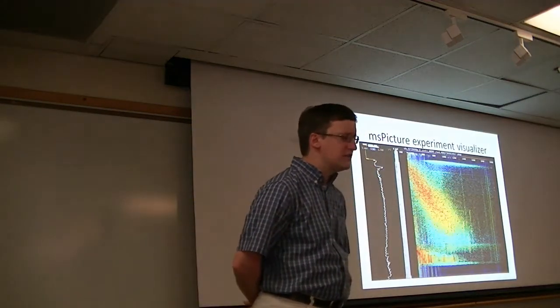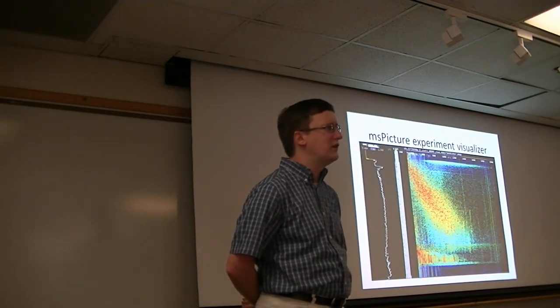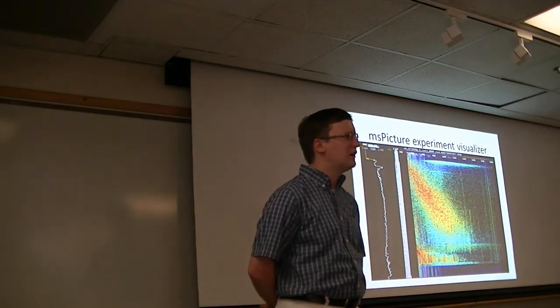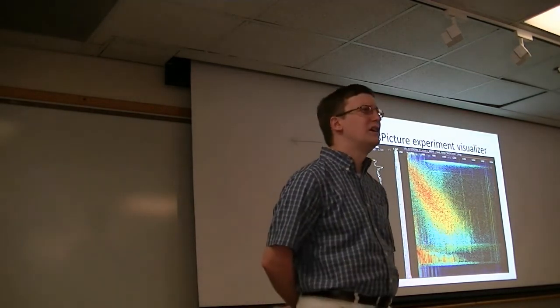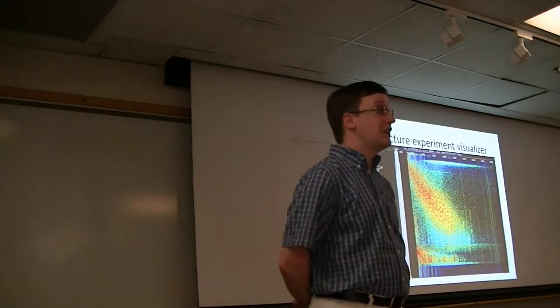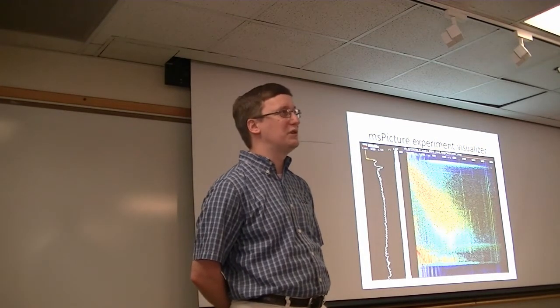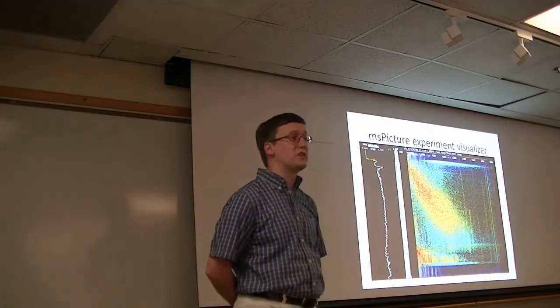MS Picture is one of the earliest pieces in ProteoWizard designed for the goal of quality control. Quality control is a topic that I care about a lot, and I think that many other labs out there are beginning to sense that they need to do something about it. If you've run experiments that spanned 10 months on the same instrument, for example, you're going to have some batch effects. The instrument is going to behave a little differently as it goes through tuning or recalibration, and being able to evaluate that graphically is one of the things that was first feasible with MS Picture.